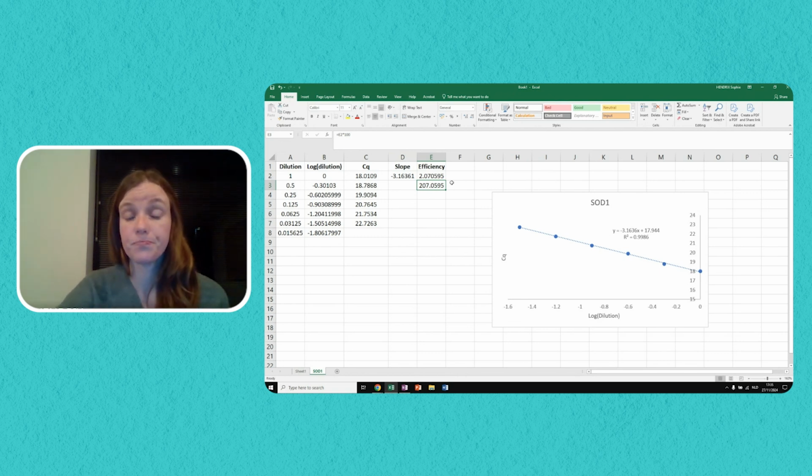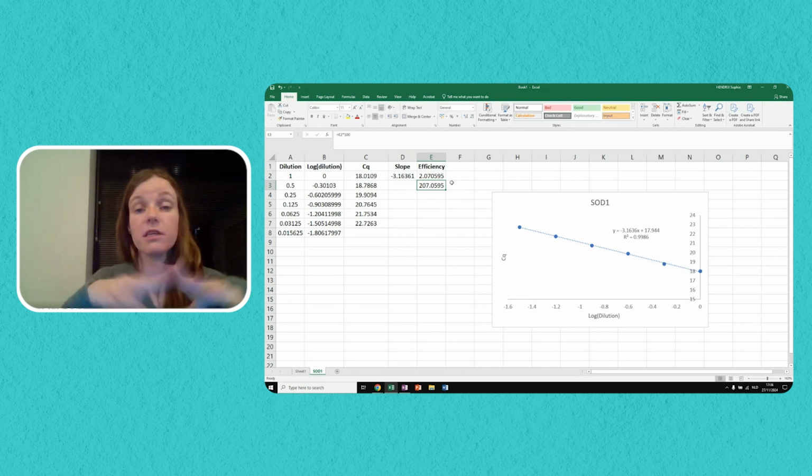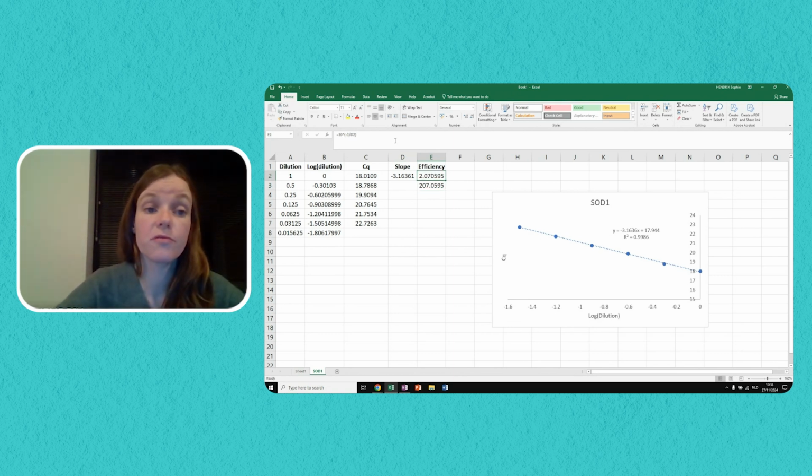But as we want to express the values as a percentage, and ideally we see 100% as a perfect result, we use the formula with the -1 added in back to be able to calculate a percentage where 100% is a perfect primer efficiency.